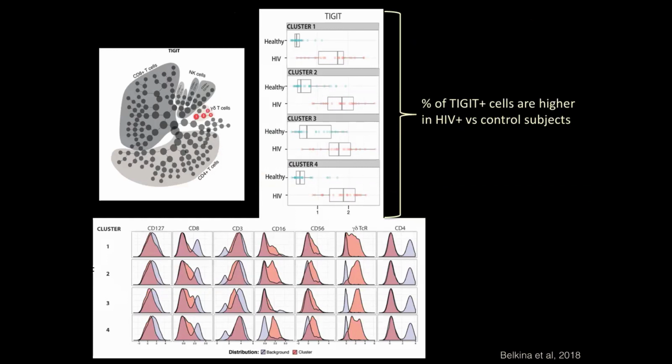And this is when you may want to subsample just gamma delta T cells from your data set into a separate citrus run to be able to find smaller but biologically meaningful subsets that would be too small for the cutoff of your larger run. Because as you can imagine, gamma delta T cells in blood would be probably less than 5%. So if you're subsetting them further, it's really hard to get clustering done cleanly with the universal cutoff.